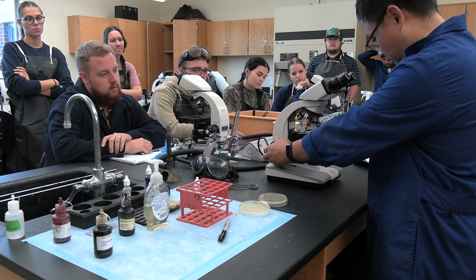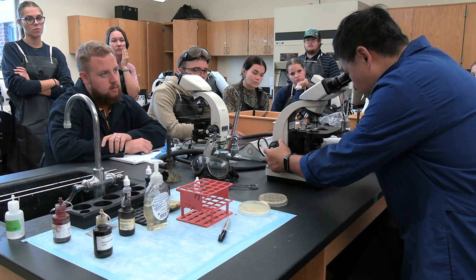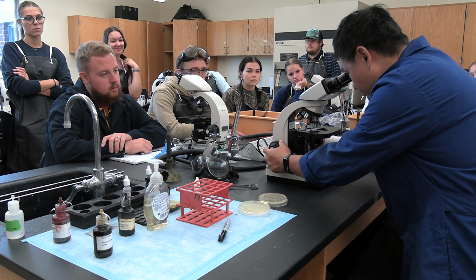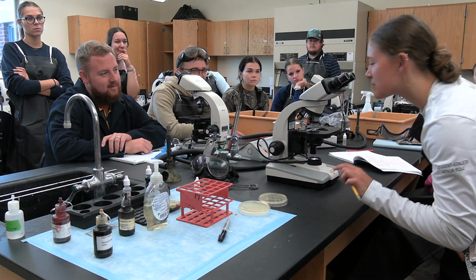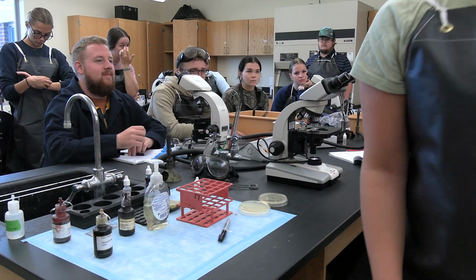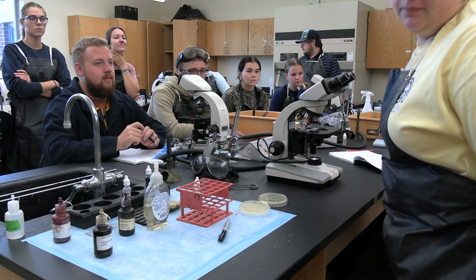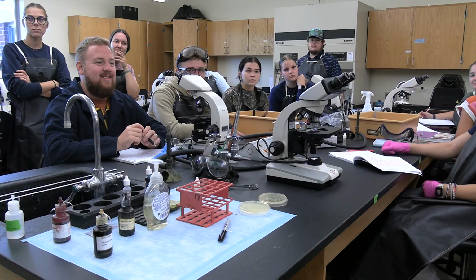Okay, so we go stage up, stage up, stage up to the place where you can move it. So we go stage down, stage down, stage down a little bit. Okay, we should see a very beautiful picture right here. Can you please take a look? That's 10x. Take a look. Can you please take a look? That's efficient 10x. Very good. Go ahead and take a look.